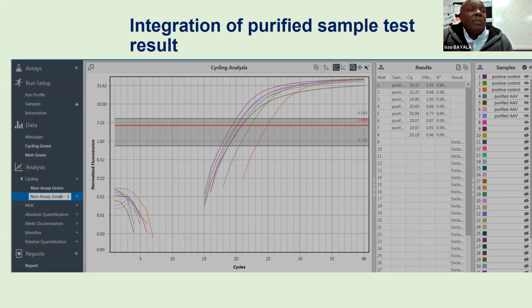The software also gives the number of cycles for each tube. Each graph color corresponds to a different tube. So the software tells how many cycles it takes to detect each sample. From here, you can actually collect the CQs, and use them to plot a standard calibration graph.